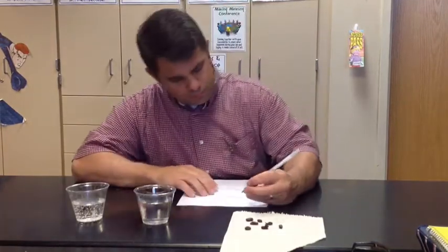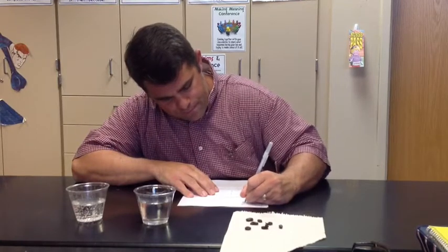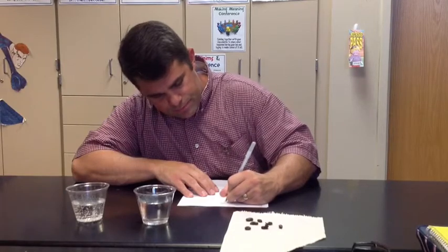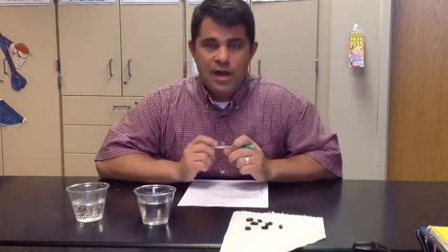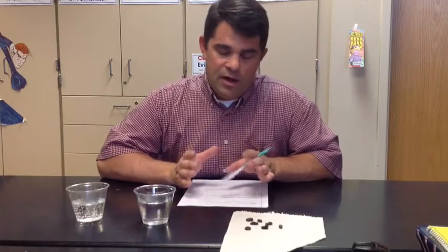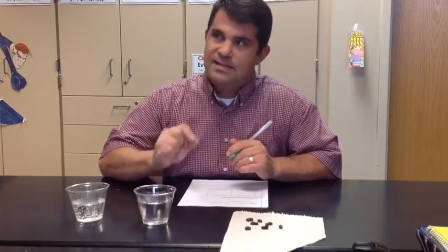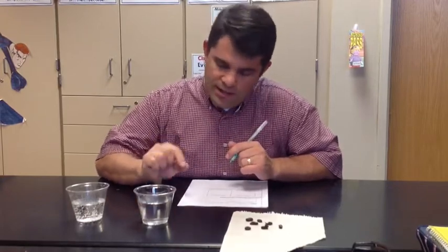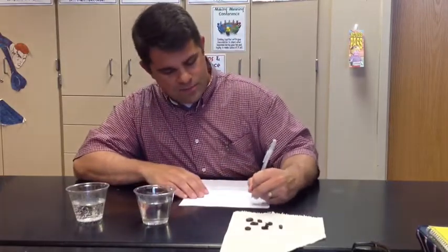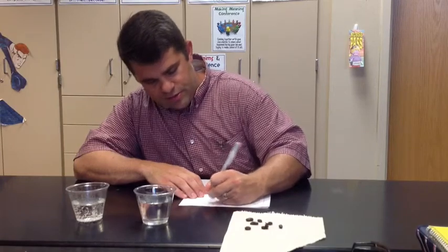Number two: observe what happens. If you think nothing happens, wait for about 30 seconds and observe it — really get some detail out of it. Tell me what is going on, what it looks like. So step two is: observe what happens, wait 30 seconds.